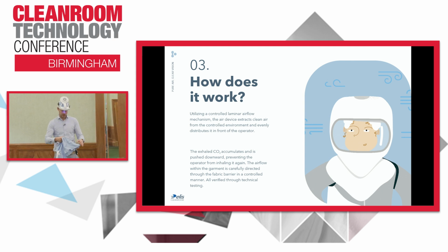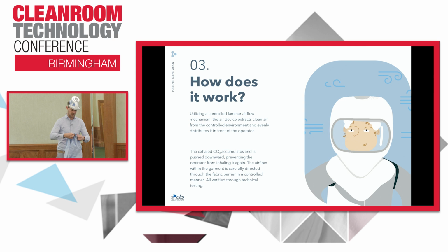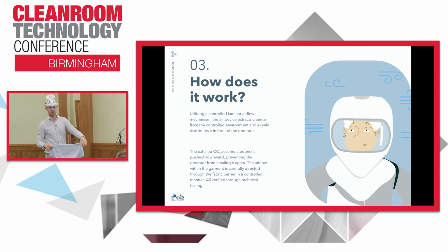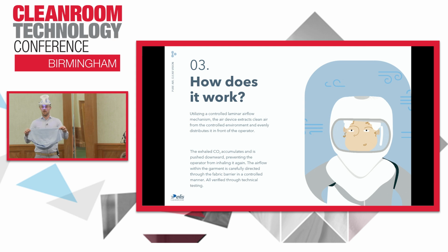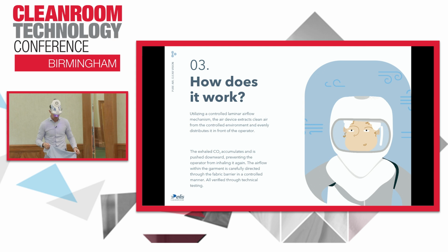I'm now going to turn the hood outside out, so bear with me. And then I'll show how you can expect it from the laundry, because I'm not the greatest folder. So this is the outside out, going inside the hood itself. There's a rope inside, so it is going to be delivered like this. At one end it's protecting the visor, and on the other end it's also protecting the visor. But if you are releasing it from the package, then you only touch the inside. That's of course really a prerequisite.